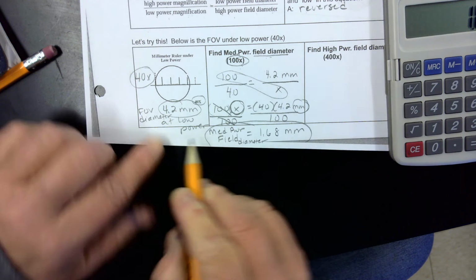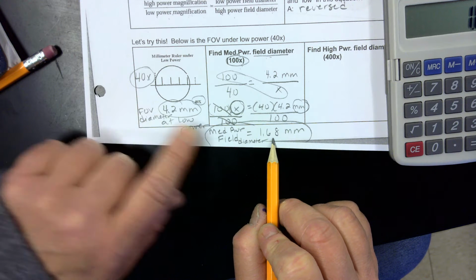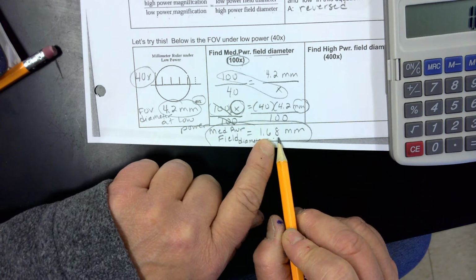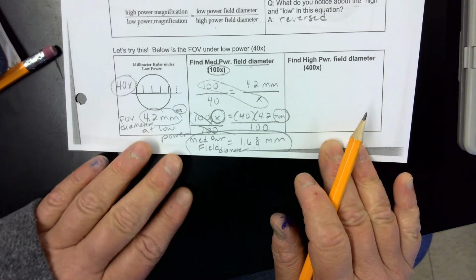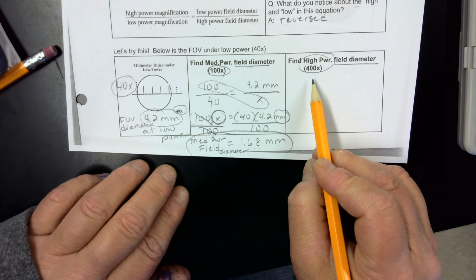So under low power, we could see 4.2 millimeters. Under medium power, we could only see 1.68 millimeters, which makes sense. We magnified the image, so we're seeing less of it. Right? So let's try using this information to figure out what's the field diameter when we make the power go to 400x.